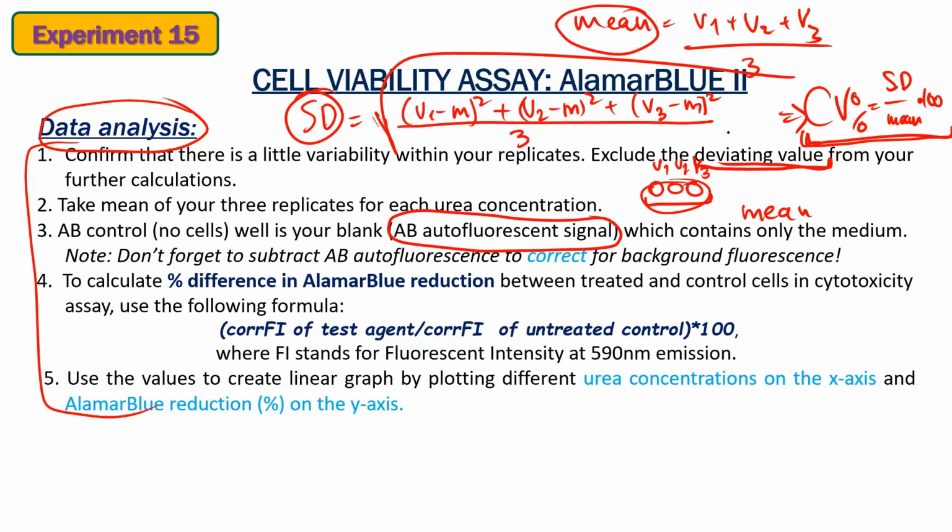Okay, so you calculated all those things. You know the mean of your blank, and then you are going to start with the calculation of your values for each of the treatments in the experiment.